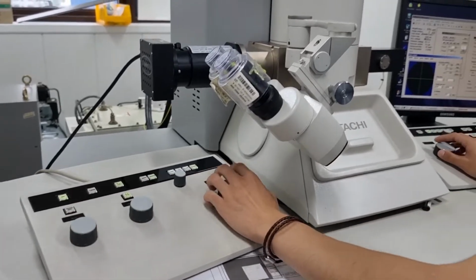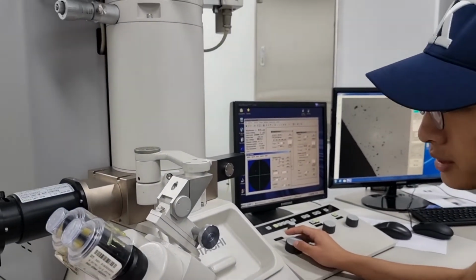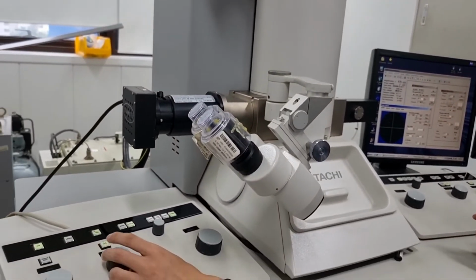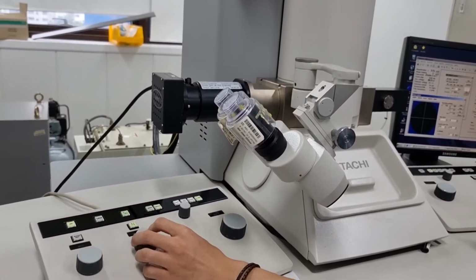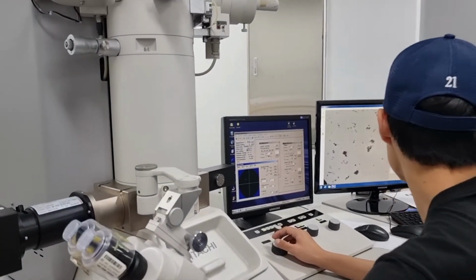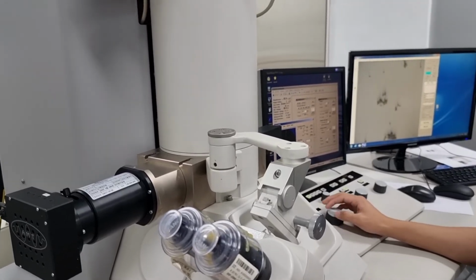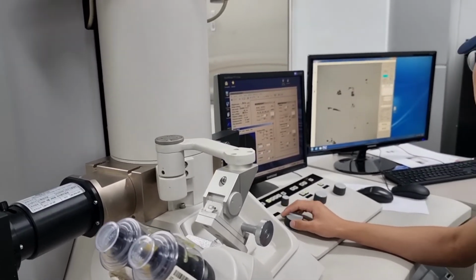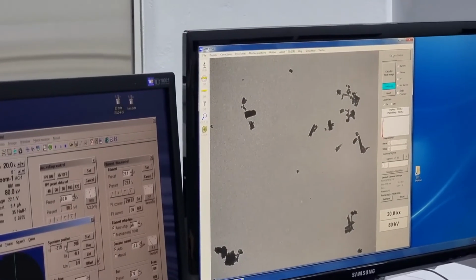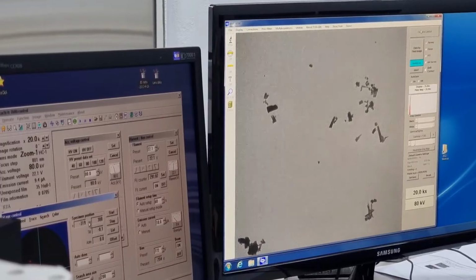And it naturally gets darker as you apply more magnification inside the sample. So you should also change the brightness. And finally, if you think you found the sample you think best represents what you're about to tell, you should change the focus to make it a better picture.